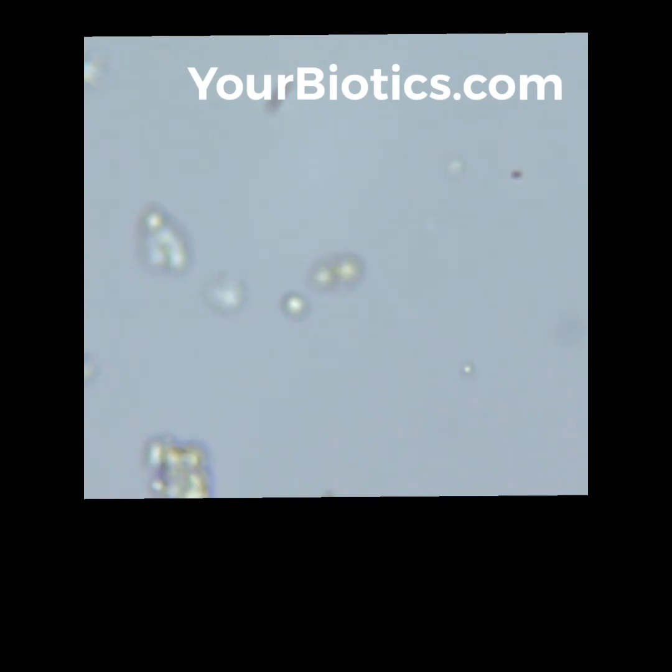If we were to wait long enough, you'd even see some cell division. This is a powdered probiotic called YourBiotics — in water, it comes to life. These are the different layers of magnification. It's a pretty fascinating look at what's really going on. When these type of cells get into a body, where there's all kinds of body fluids and other cells, they will multiply even faster because they have a food source around them.